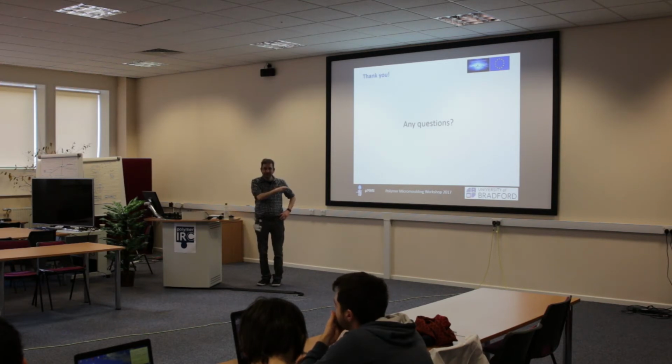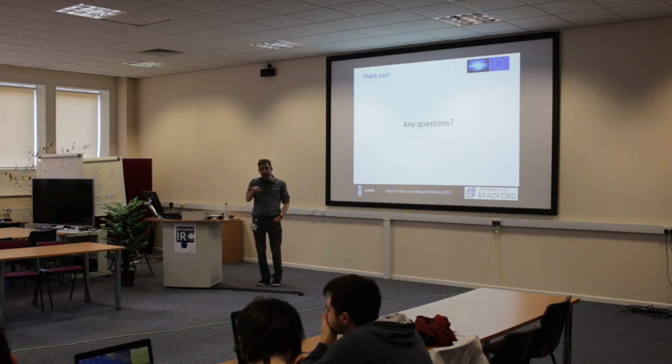If you run TGA at the same time, by the time you get to your degradation temperatures, if you want to cool down again, then what are you going to see? You're going to see an entirely different material. You've burnt out a lot of the material that's there. So yes, on a single run, I can see how that would work. But if you want to actually look at the effect of process history and the cooling, then it's not going to happen.